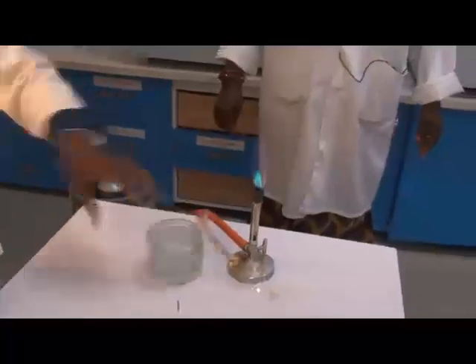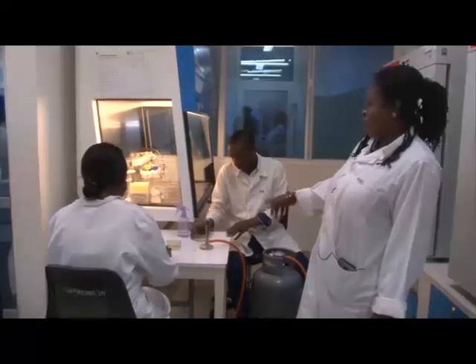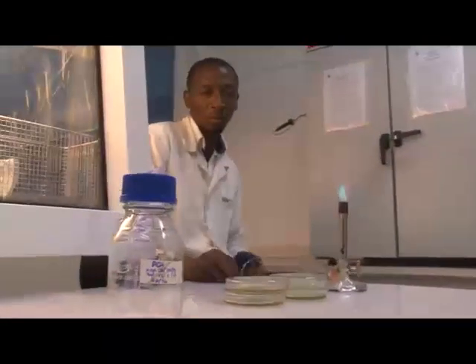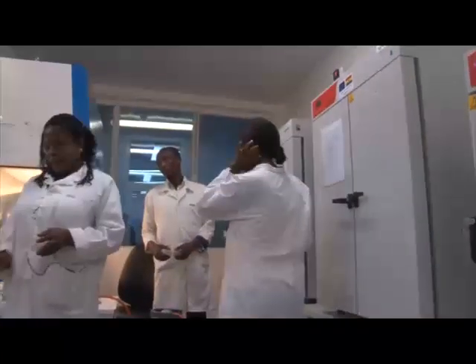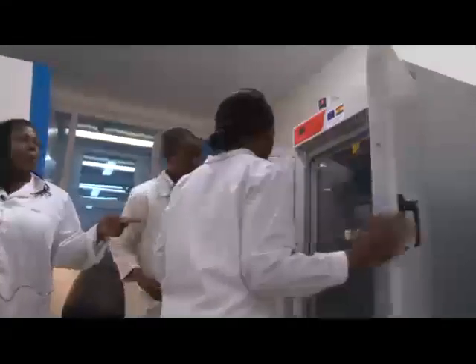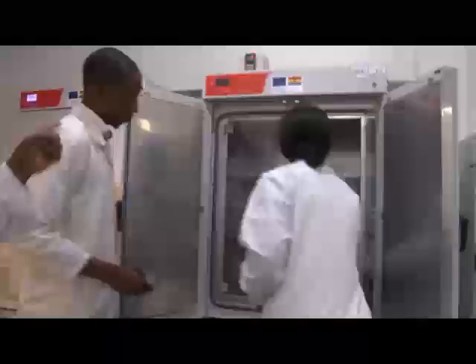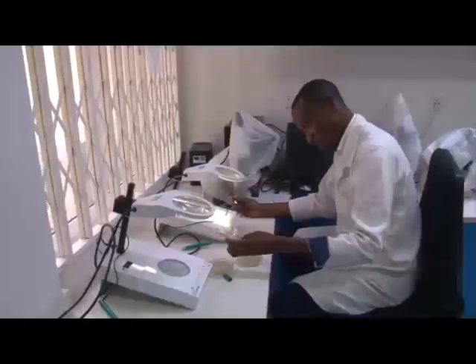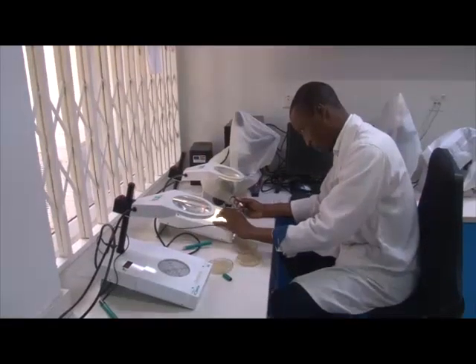Continuing the process of testing from here, Dr. Margaret Owusu, head of the Food Microbiology Lab of the CSIR Food Research Institute, talks about a mechanism that grows and makes bacteria obvious. Once they are set, then you can incubate them at the appropriate temperature and leave it to grow. The plates containing the cultured samples being analyzed are then placed in an incubator at temperatures of 30 degrees Celsius. When the plates were taken out, the microorganisms that cannot be seen with ordinary eyes and hidden in the food had grown and became exposed. The samples are then placed on a machine called the colony counter, which magnifies the characteristics of the organism. It is also the formula for counting and to know the density of the colony or pathogens.